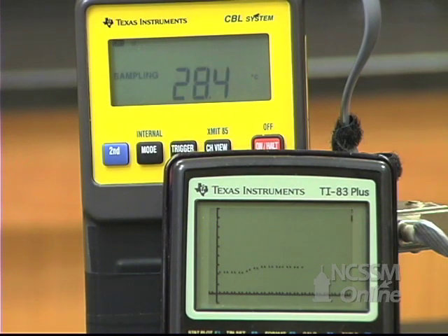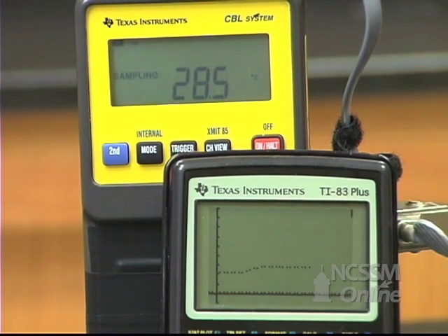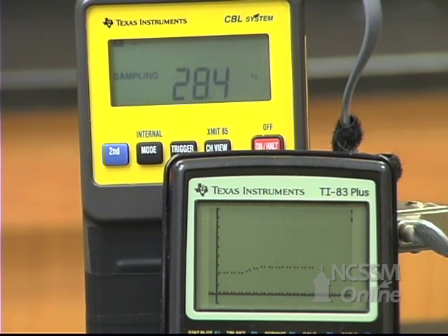As the compounds react, heat is given off and absorbed by the water. The temperature of the solution goes up and is recorded on the calculator.